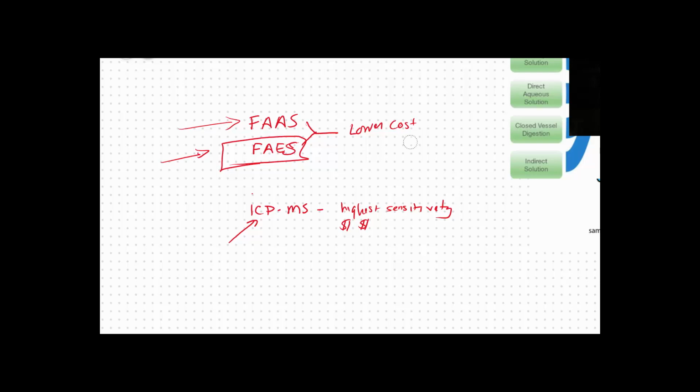So I have just thrown out a whole lot of words. How do we use these things? Well, what does the temperature have to do with anything? I mean, I just said that ICP-MS is very expensive and it gets very, very hot. Well, big deal. Why do we care about what temperature it is? Well, the temperature of the atomization has to do with how much of your sample becomes excited and how much is in the ground state.